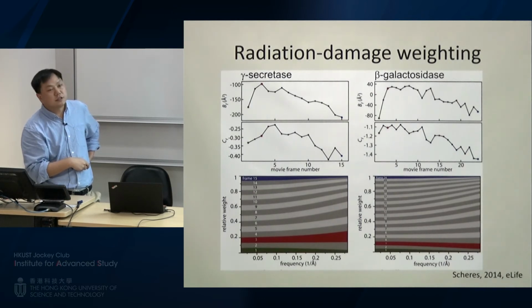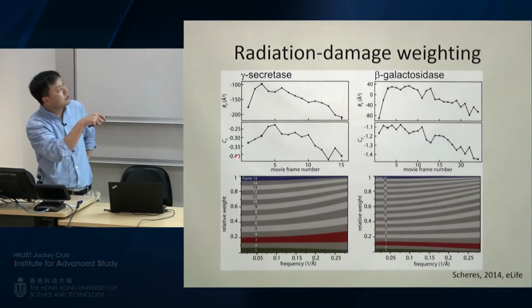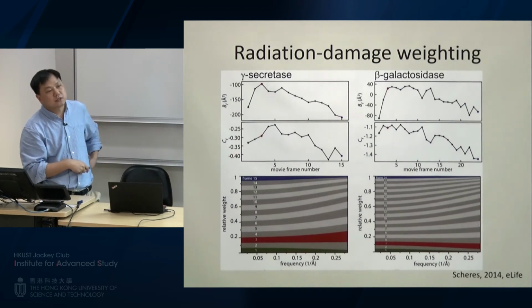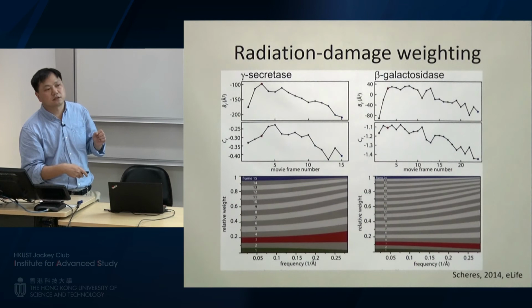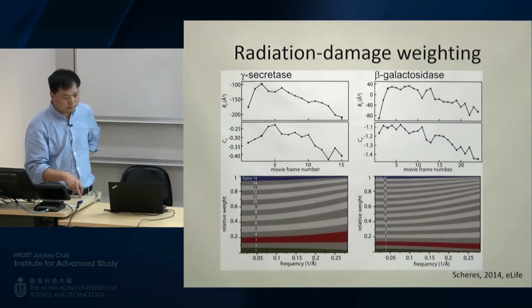That means each frame contributes differently to the final image. Also this weighting is dependent on frequency, because the radiation damage will first destroy the high resolution features, then the low resolution features will be preserved much better.